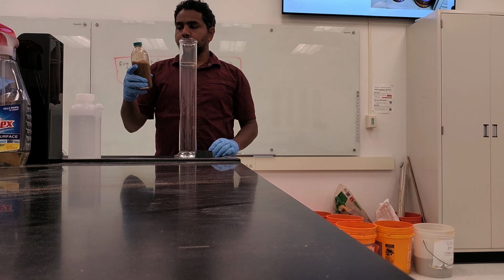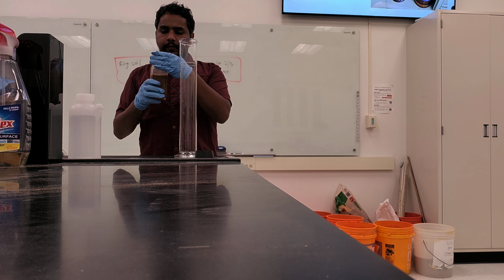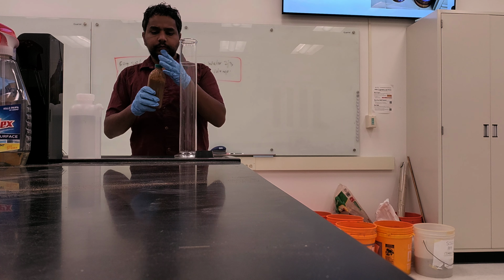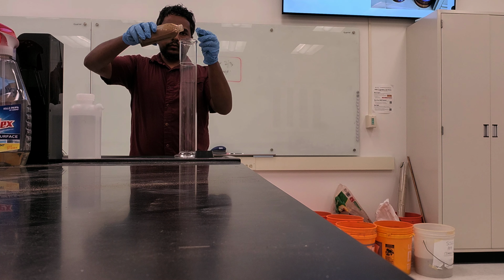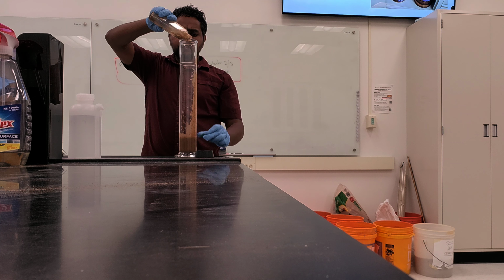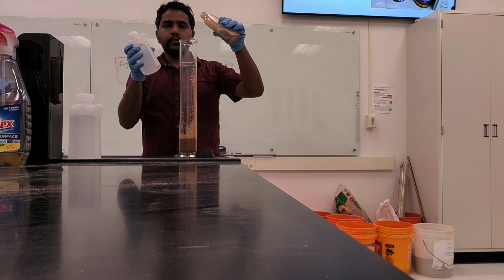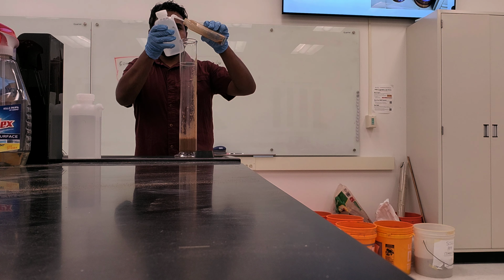And the next step would be we'll have to transfer this sediment to this cylinder. And the leftover we'll need to clean with DI water.